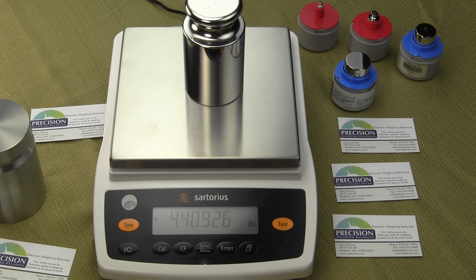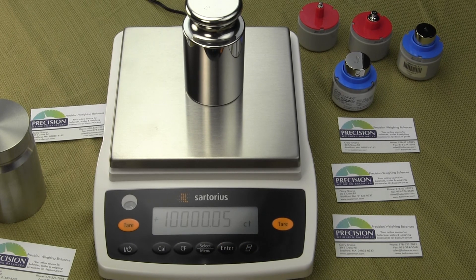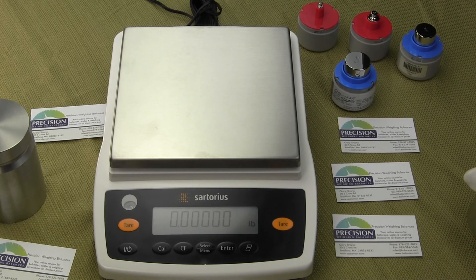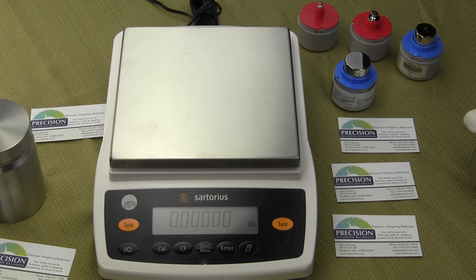We're back into our standard weigh mode. Remember, we set up the balance so the primary weigh unit was pounds. If we want to weigh in a different unit, simply hit enter — the next unit is carats. Hit enter again — the next unit is ounces. Next is grains (GN). Hit enter again and we're in pennyweight. And we're back to pounds. Our primary unit is now configured to pounds.